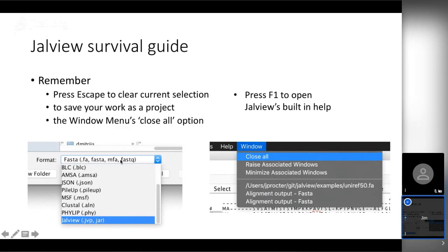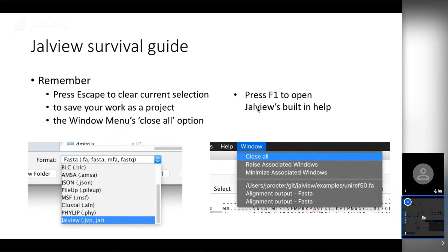Jalview has a thing called projects, which you can find when you look at the save box and scroll to the bottom of the format option drop-down menu. The Jalview projects are called .JVP files — they save everything in the session: trees, PDB structures, views of the structure, and all the different multiple views of multiple sequence alignments. If you want to save all the data associated with a figure, save it to a project. You can load it back in later, even if a new version has come out. There's also an option called Close All under the Windows menu, which is useful for closing the current set of windows. And pressing F1 opens built-in help, which is pretty extensive.